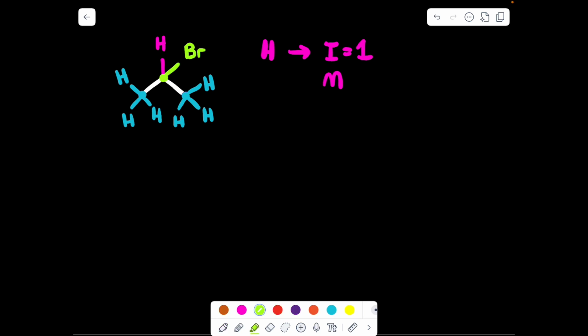Multiplicity, well, how many hydrogens are J3 away? Starting from the pink hydrogen, we have 1 bond, 2 bond, 3 bond, gotcha, 1. 1 bond, 2 bond, 3 bond, gotcha, 2. And so on for each of the others. I hope you're seeing the vision here. So this would be 6. We would have 1, 2, 3, 4, 5, 6 neighbors. So the neighbors is equal to 6.